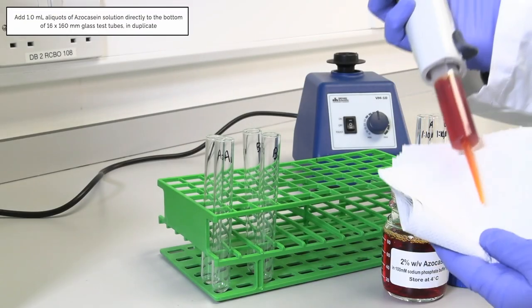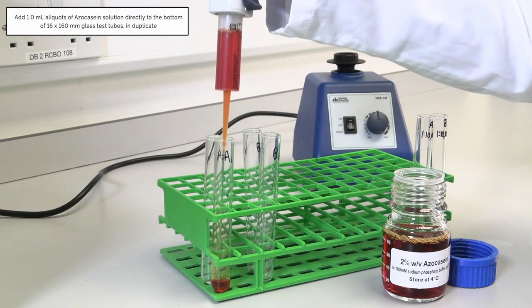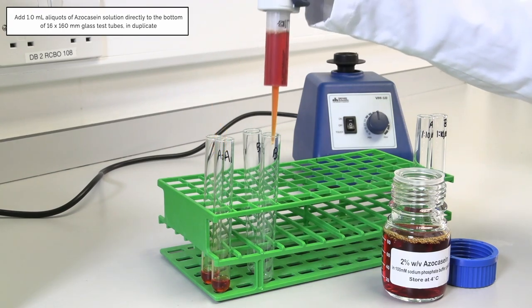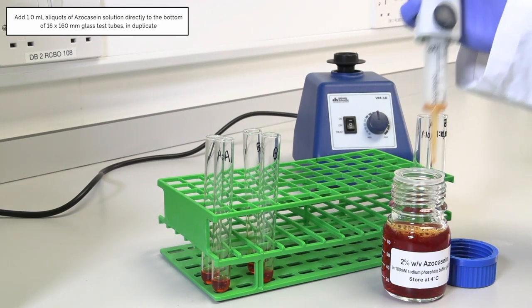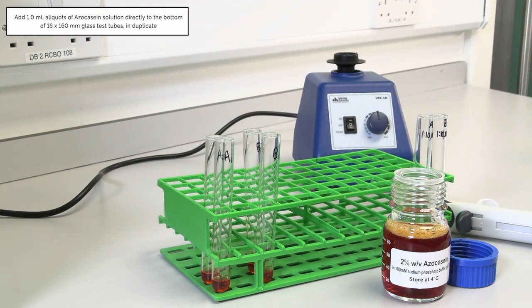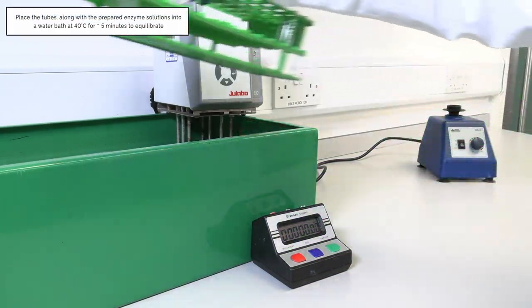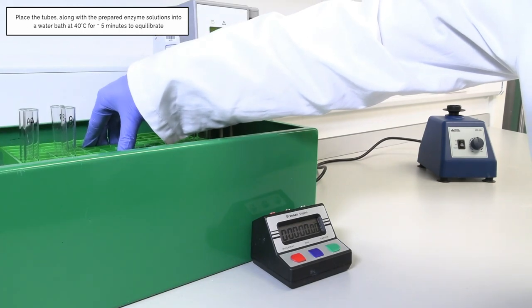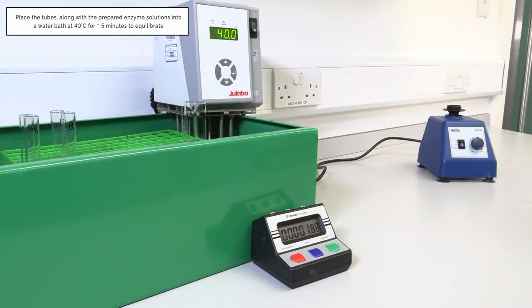As the azo casein substrate is quite viscous, use a positive displacement dispenser to transfer 1 ml aliquots of azo casein solution directly to the bottom of 16 by 160 mm glass test tubes in duplicate. Place the tubes along with the prepared enzyme solutions into a water bath at 40 degrees Celsius for approximately 5 minutes to equilibrate.